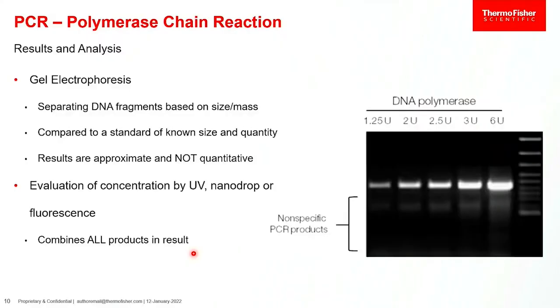In this experiment, I just pulled this as an example. It's not intended to show you anything. Units are the amount of polymerase enzyme that was added to this reaction. So this experiment is looking at how much product you made versus how much enzyme you added, which really isn't applicable for our talk, but I wanted a nice picture of a gel. And that's how we typically talk about a quantity of an enzyme, as a unit.